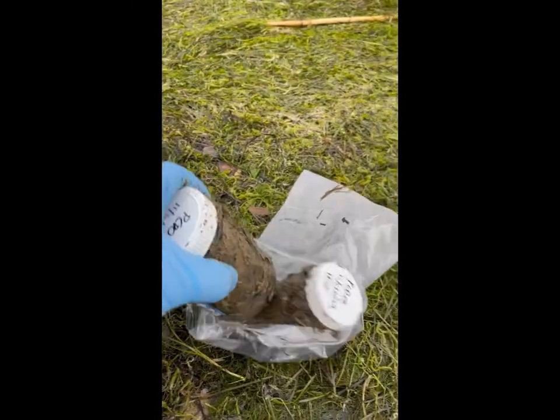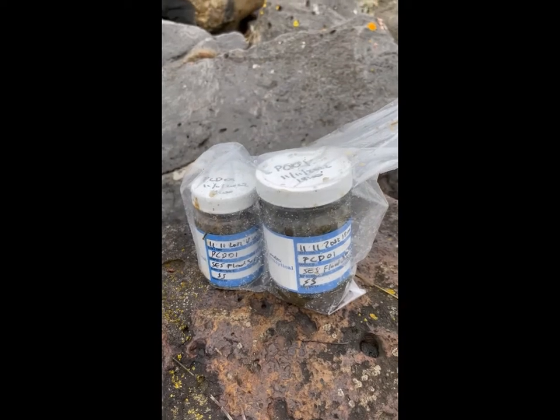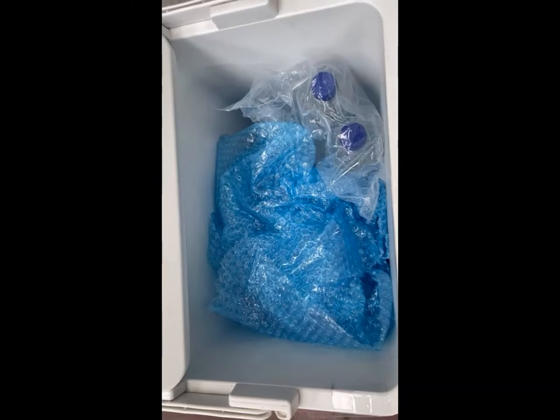If you have a plastic bag, it is useful to put both the jars inside to avoid dirt in the esky. Place both jars on ice and organise return shipping to the labs for analysis as soon as possible.